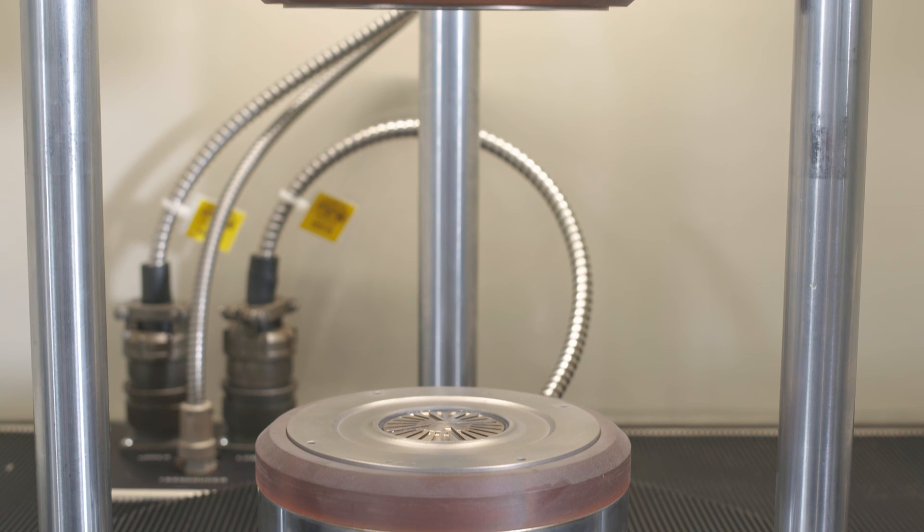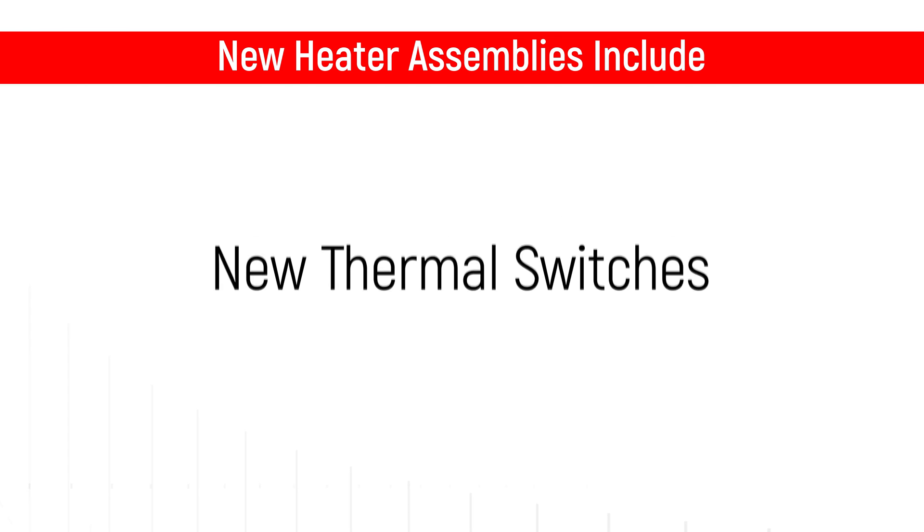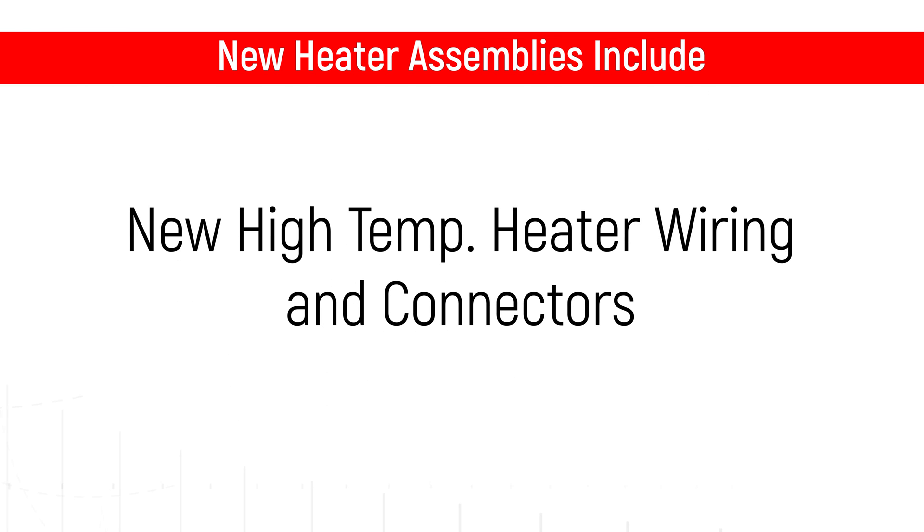Next we install new die heater assemblies in both the upper and lower platens. This includes new dies, temperature sensors, heaters, thermal switches, insulators, high-temperature heater wiring and connectors.